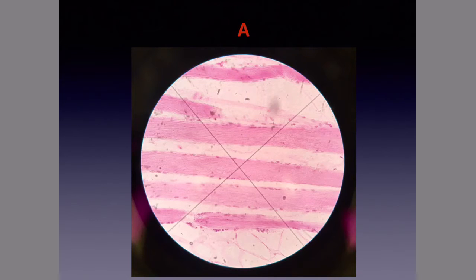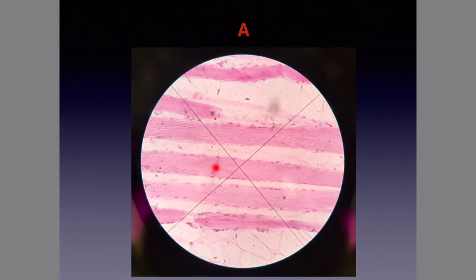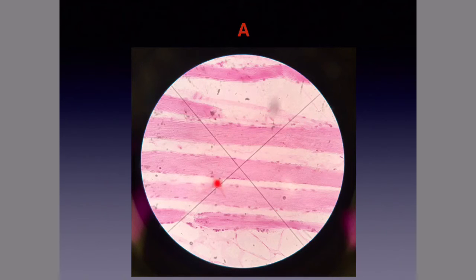Slide A. If you take a look at slide A here, you can see long fibers. They are multinucleated, and you can see some striated patterns in these long, thin, linear fibers, and so this would be skeletal muscle.